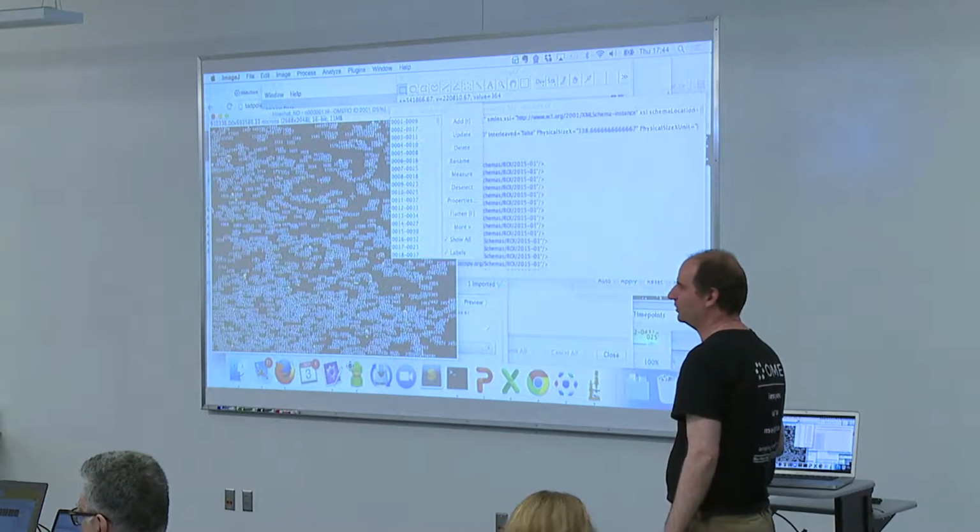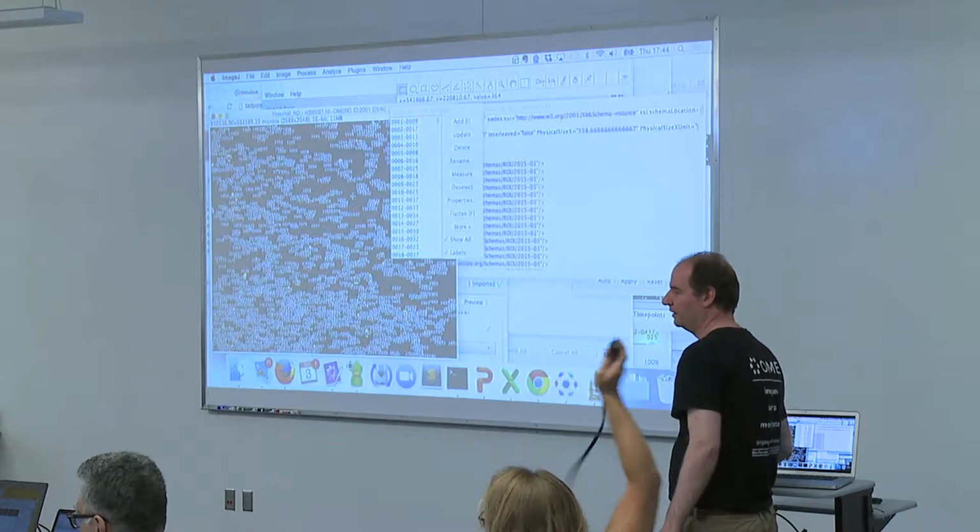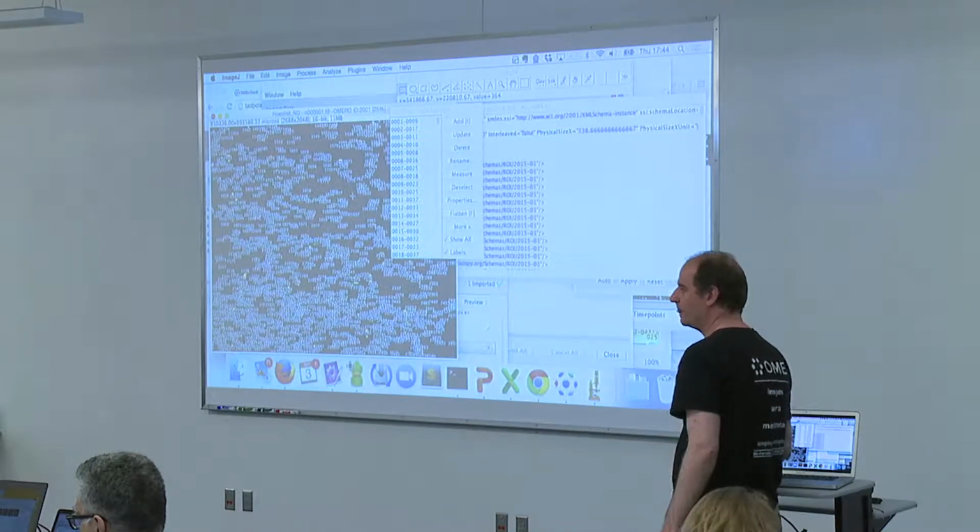Can you please speak much louder? Okay. Does OMERO log exactly what steps you're doing as you're doing it? Or?